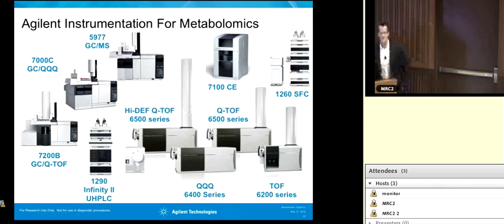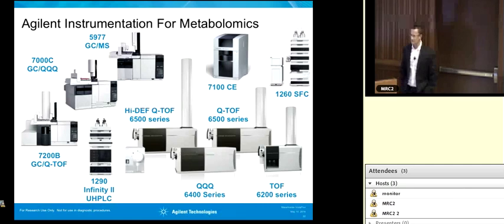But we're going to talk about a different cancer cell line, chondrosarcoma, but we're still going to talk about the mutation that occurs in IDH2. So what we see here, if you look at the TCA cycle, we start off, and we were curious because we have an arrow that should typically go this way for glutamate as it's taken up into the TCA cycle.